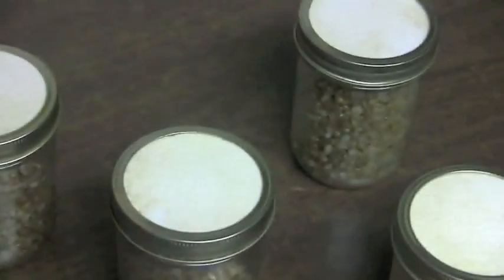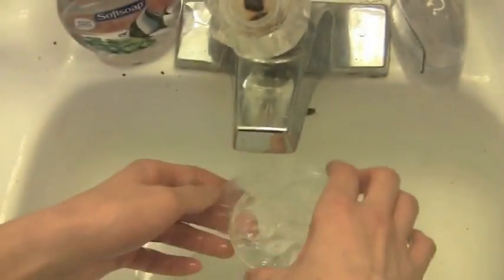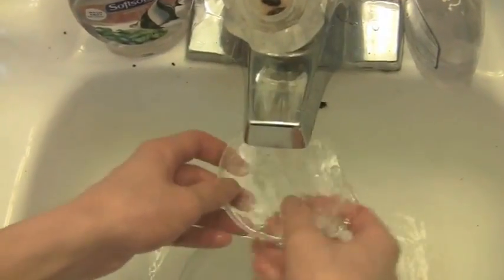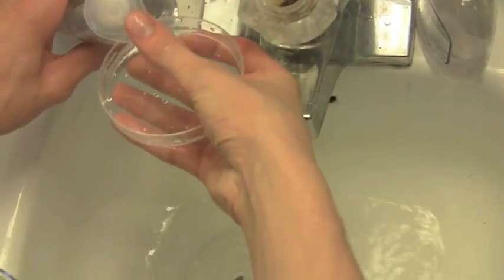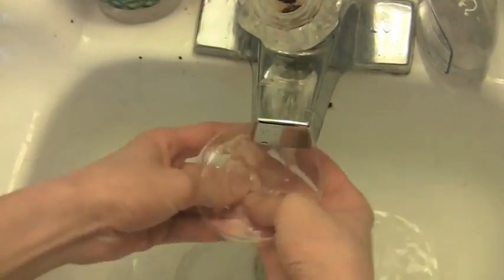So there's our wedges inside the jars, and the final procedure is to wash things up. It's the first time we've done this. We have glass so we can reuse it. A little soap and water, and it's a wrap.